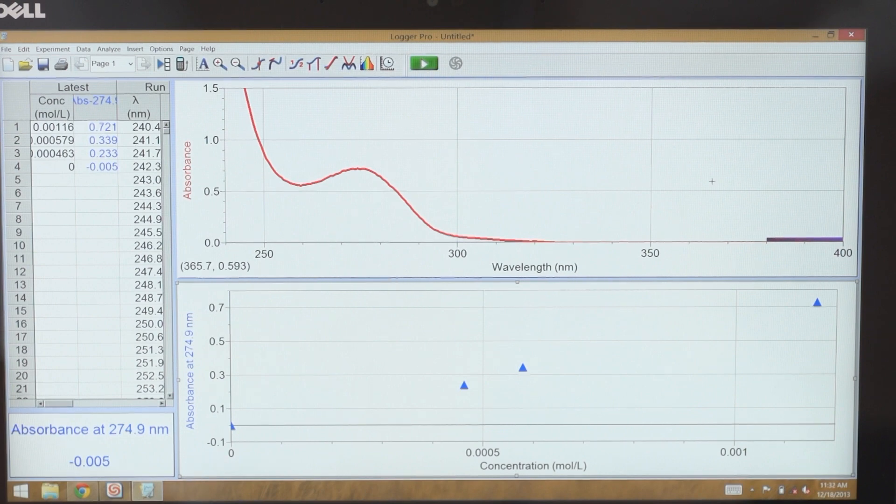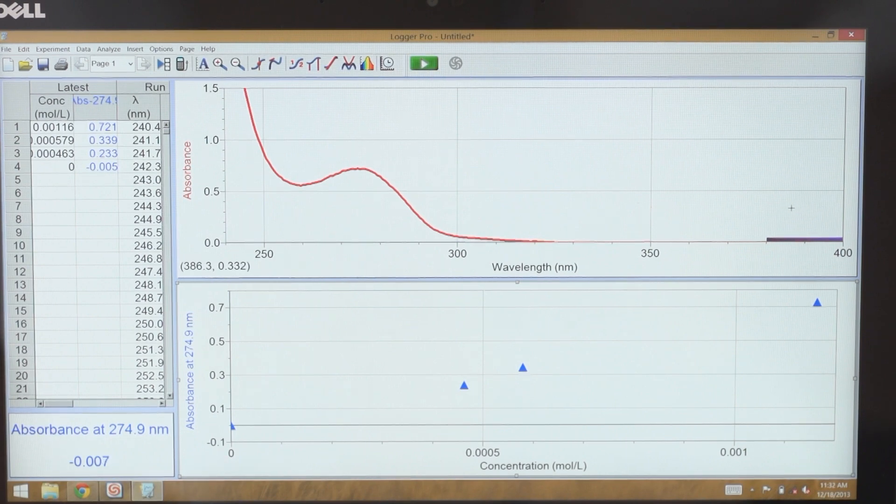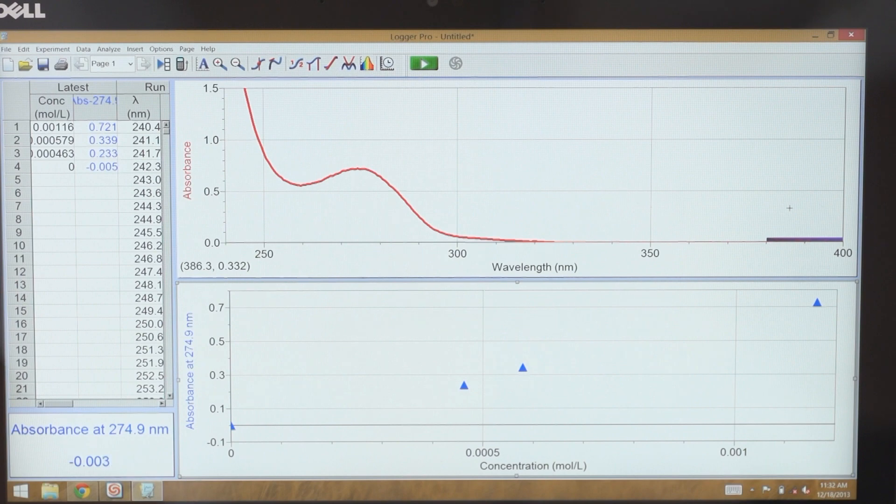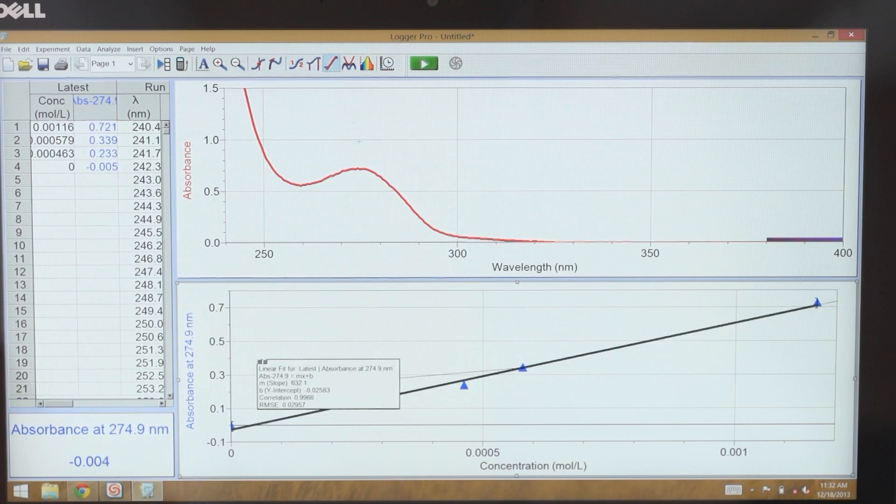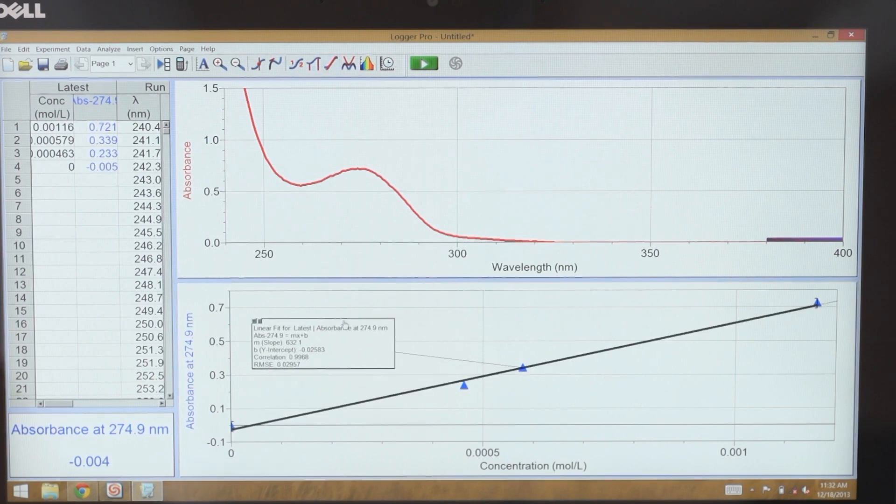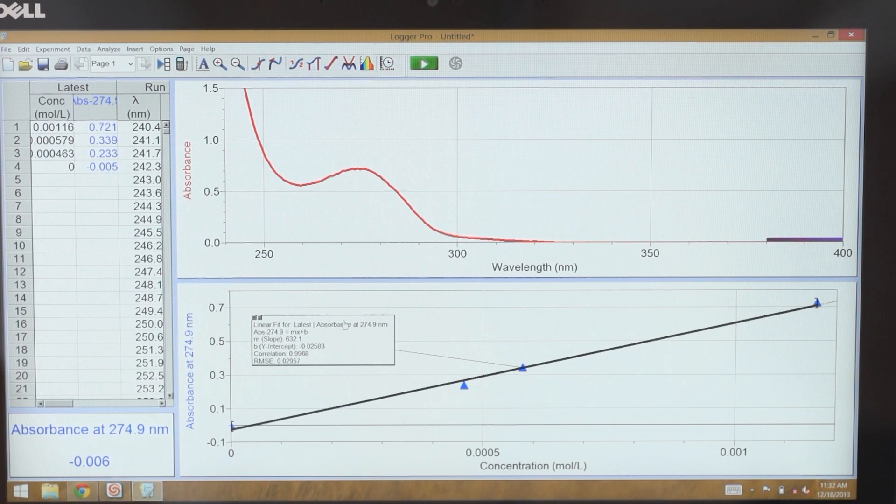Then it will automatically auto-scale my data, so I see my data will fit nicely to a line like it should with a Beer's Law analysis. And then I can do a linear fit right within Logger Pro to get my slope and y-intercept to calculate an extinction coefficient.